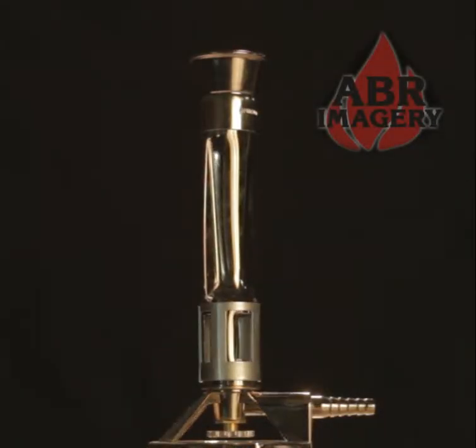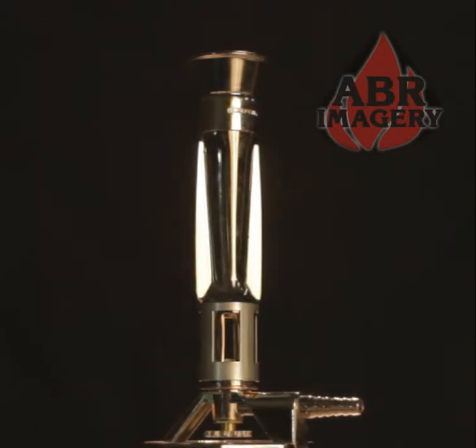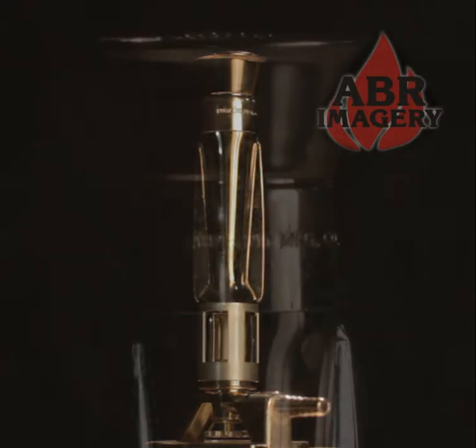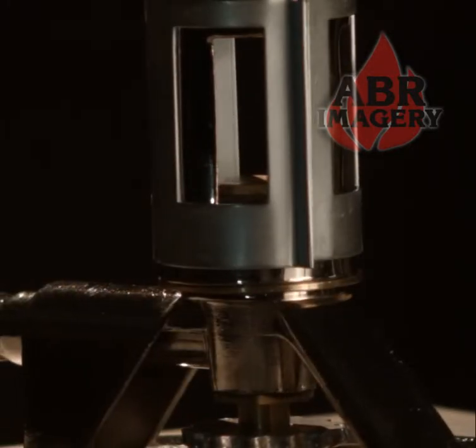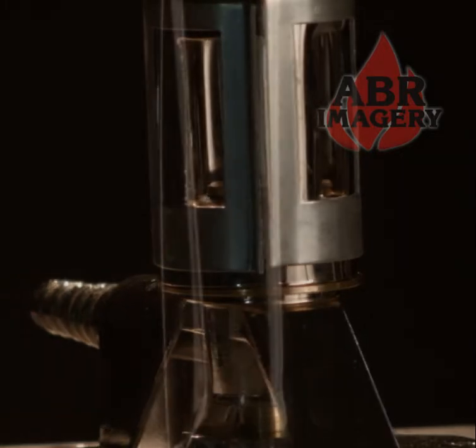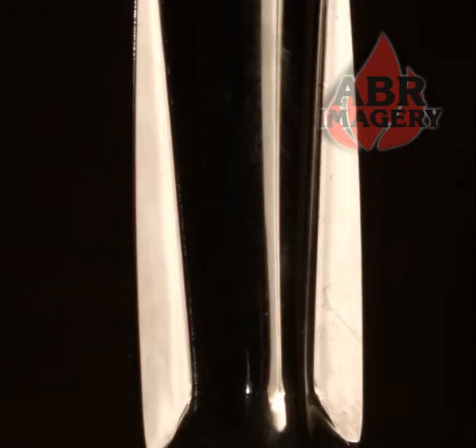When an extremely hot flame is required, these mechotype burners form uniform blue cones of intense heat with no backflashes. A one-piece nickel-plated venturi tube and a die-cast zinc alloy nickel-plated octagonal base — this burner is great for flame-annealing pieces or keeping critical areas warm while working on other sections of glass.